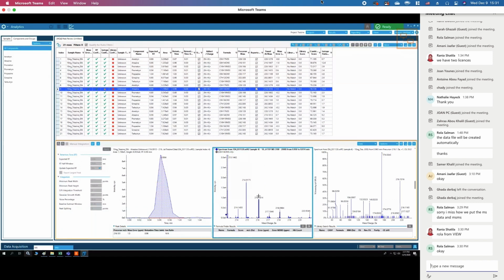So you see there's the monoisotopic, there's the 1C13, and this one is a little taller. This is the 2C13, but it's also the chlorine 35, the chlorine 37. Right? This is 1 chlorine 37, which is 2 Daltons heavier than the 216. You can see that lined up, and there is also an isotope ratio percentage right here. So we are within 15% of what the isotope ratio should be.